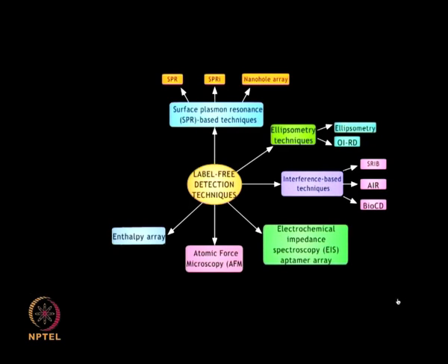Enthalpy array. Thermodynamics and kinetics of molecular interactions are measured in small sample volumes without any need for immobilization or labeling of reactants.